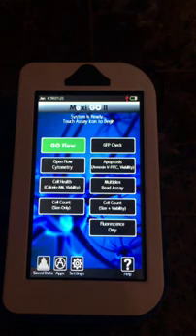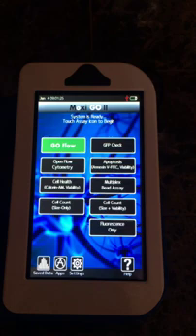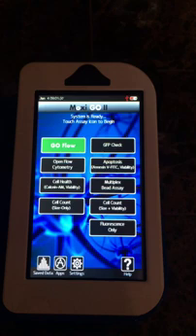In this video, we will be going over the basics of the MOXIGO2 488 cell QC analyzer by ORFLOW technologies. The MOXIGO2 uniquely combines both the Coulter method and two channels of flow cytometry while utilizing a disposable flow cell for each experiment.